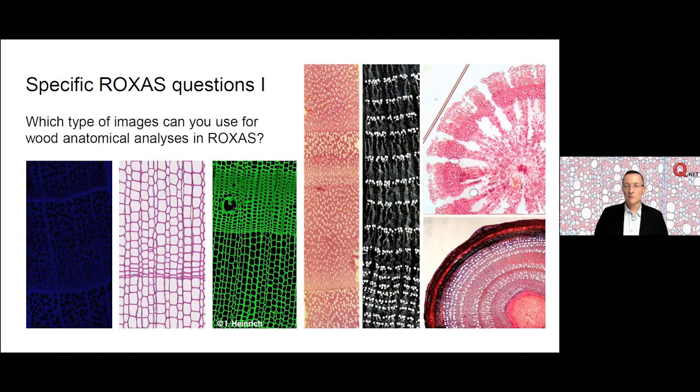Now, in the full question, there was also the question about CT, which is a nice link to what we have just heard. Roxas could also analyze, and also any other traditional image analysis tool could also analyze CT images, of course. However, only when they are extracted in a 2D way. I think Jan also showed us that this is one of the applications. So this is absolutely possible. Important is the contrast, to summarize, but also that the resolution of the target feature is sufficient, that you have a sufficient number of pixels representing your target features. So that was question one.